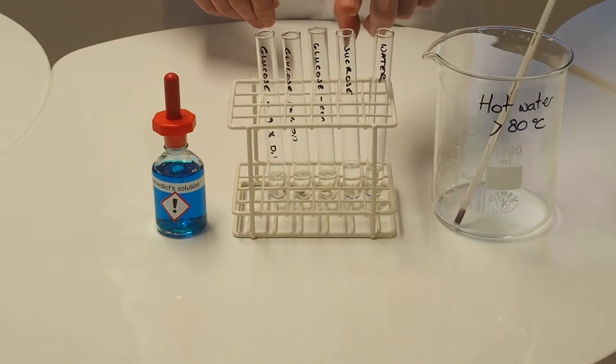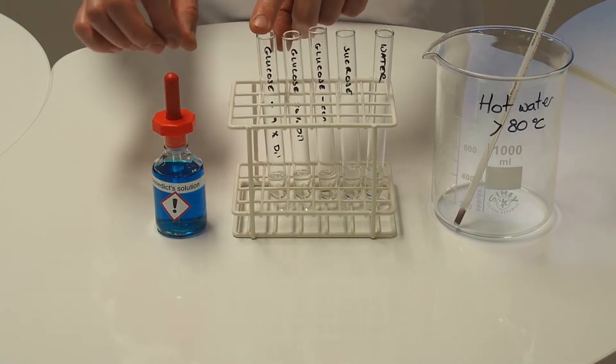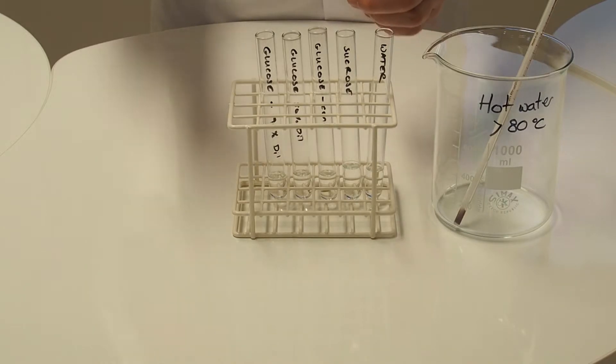Here we have five different tubes with different test substances. We've got some water as a negative control, some sucrose — ordinary table sugar — and then we've got three different dilutions of glucose, and we're going to add an approximately equal volume of Benedict's reagent to each tube.